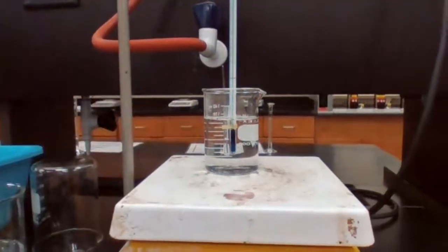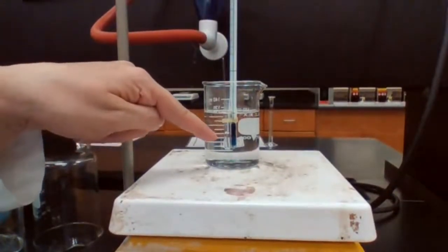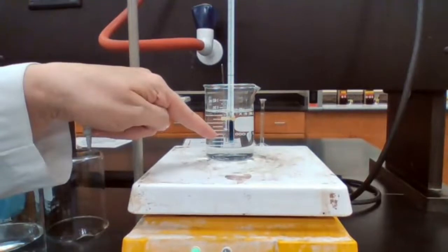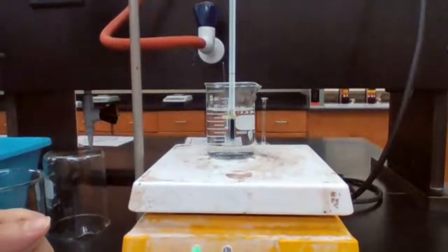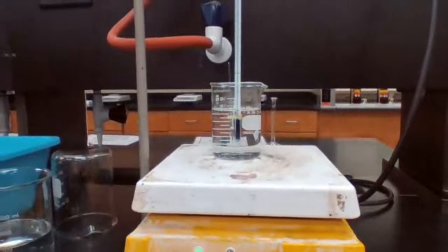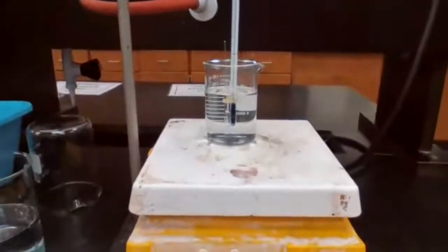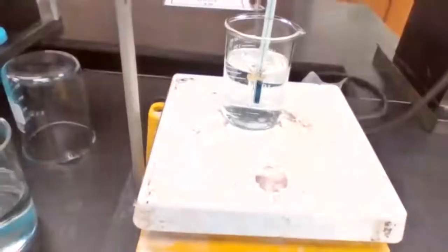Now we're getting there. Do you see those bubbles? Hopefully you see those bubbles, and if not, you have to trust me. Those bubbles are now coming out of the capillary tube. See that continuous stream of bubbles coming out of the capillary tube, and I'm recording that number as 64. So 64 would be the boiling point. You just need to know how to record, perform, and set up. I'm holding the camera closer so you can see those bubbles coming out.